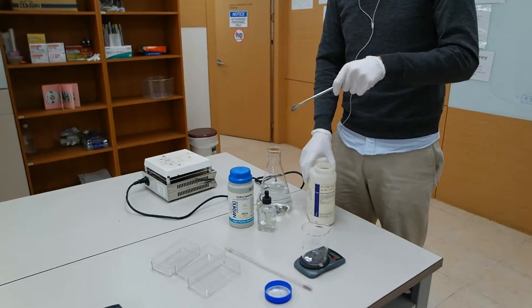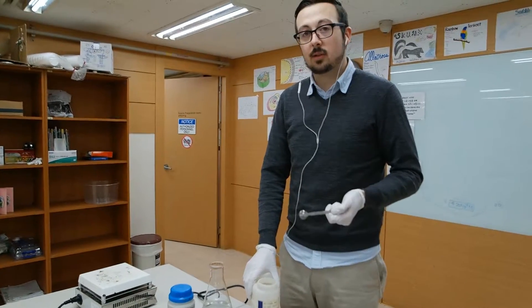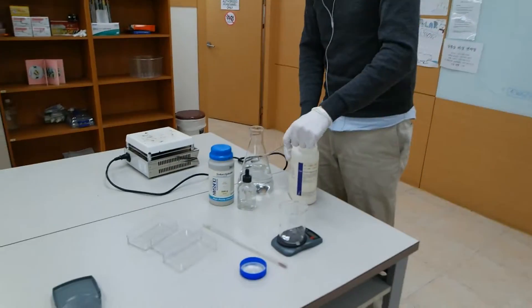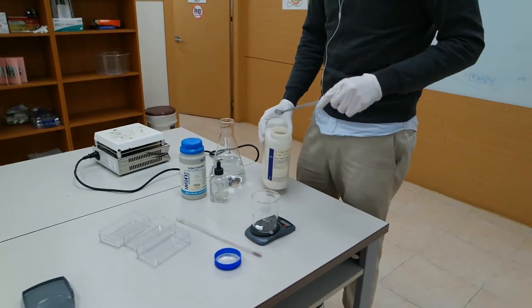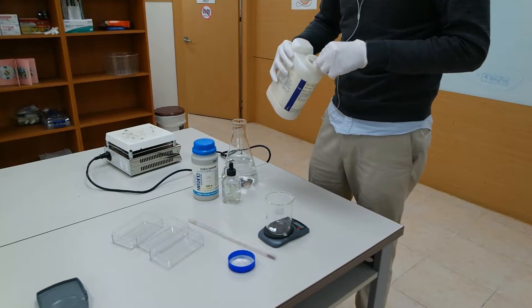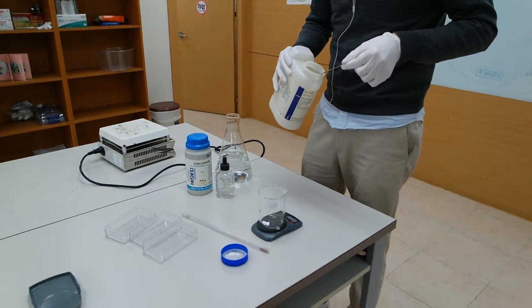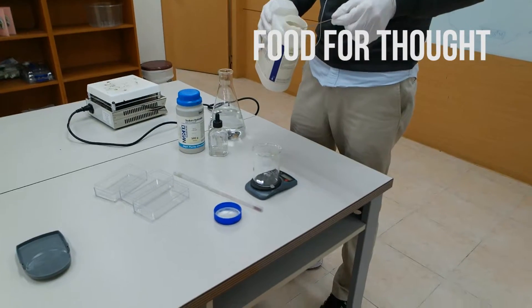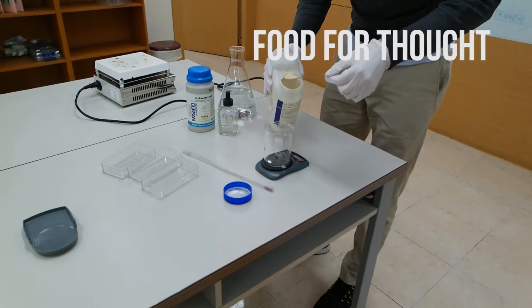Then we're gonna submerge our agar in an acidic solution and time it to make it change color. So we're gonna use the indicator as a color changer, and hopefully observe how larger blocks take longer to diffuse to the center. So their volume is greater compared to the surface area as well.